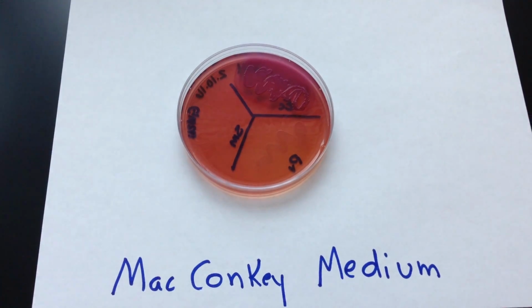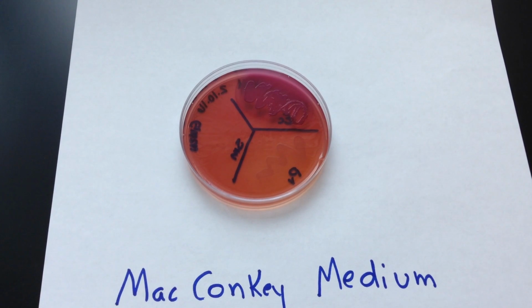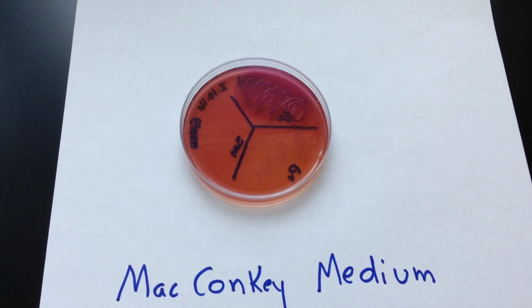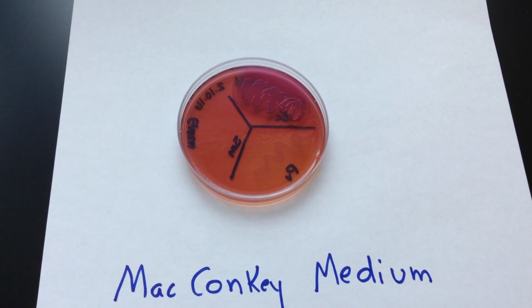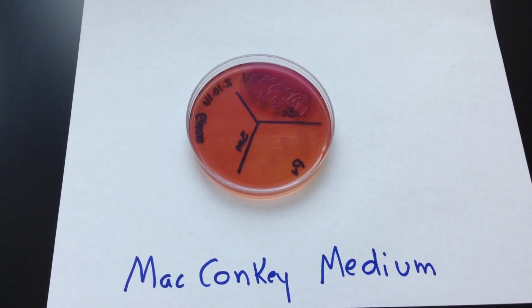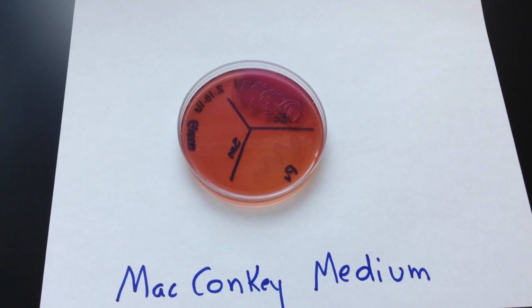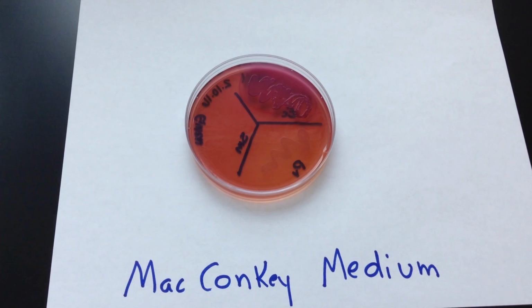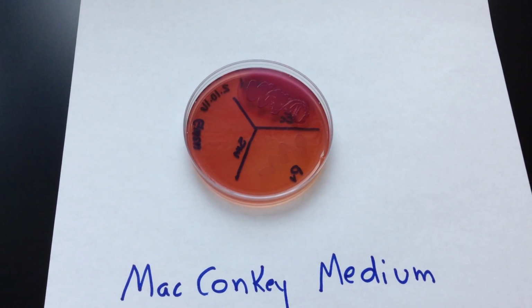This video outlines the MacConkey medium. MacConkey medium is considered a selective and differential medium. It is selective because it has two ingredients, crystal violet and bile salts, that both interfere with formation of the peptidoglycan layer in gram-positive cells. So therefore we can say it selects against gram-positive cells, so they do not grow on this medium.